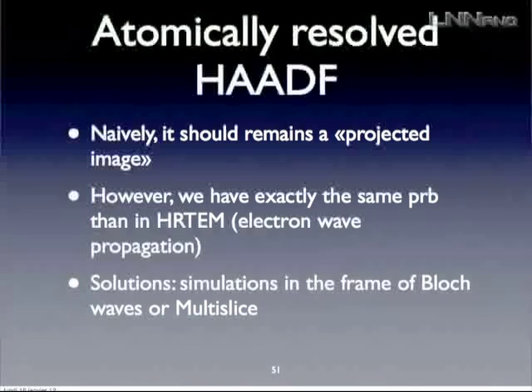Okay. So you may want to make atomically resolved HAADF, and you can do it. You need a good machine, but a 2010 with a Schottky gun does it quite properly. If you have a large lattice parameter, say 3 angstrom, it should not be a problem, typically. If you want to have 1 angstrom, it's a problem.